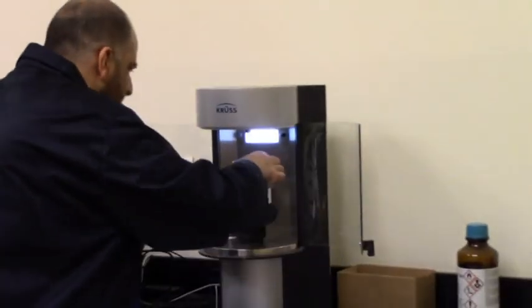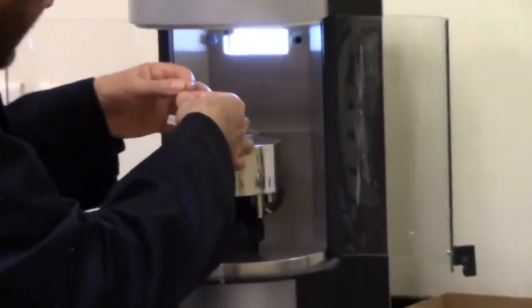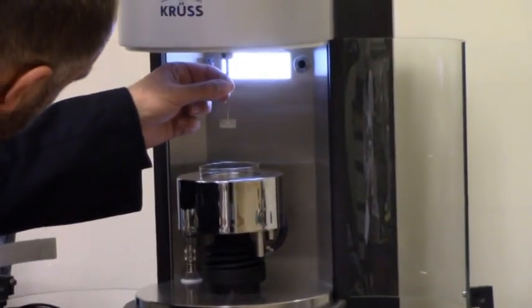So I put the vessel here. I hook the plate up there. I move the vessel up.